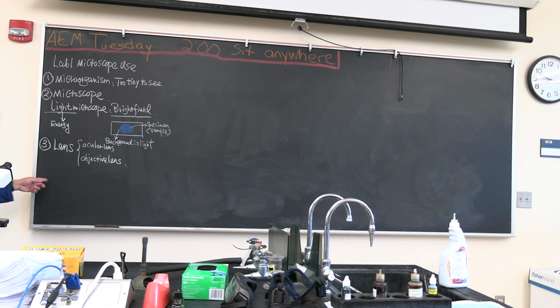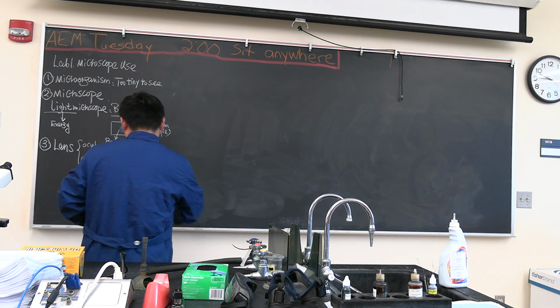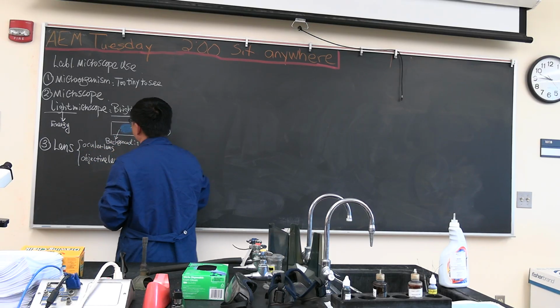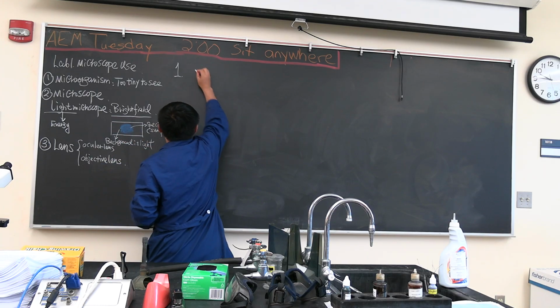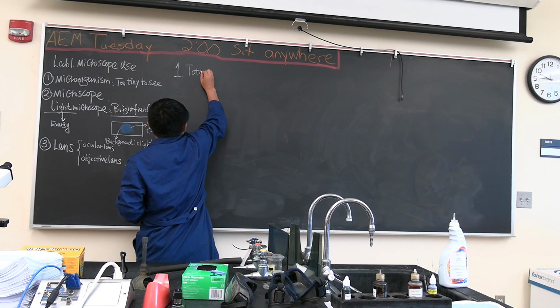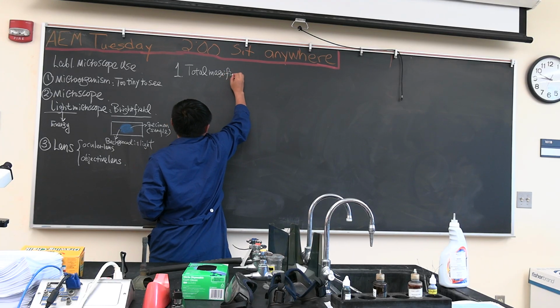We also talk about using the microscope to observe microorganisms, because microorganisms are too small, too tiny to see. Therefore, it comes to our first terminology, total magnification.